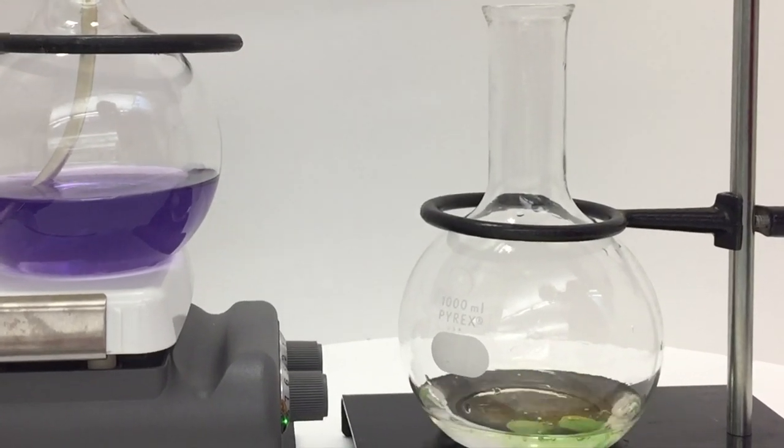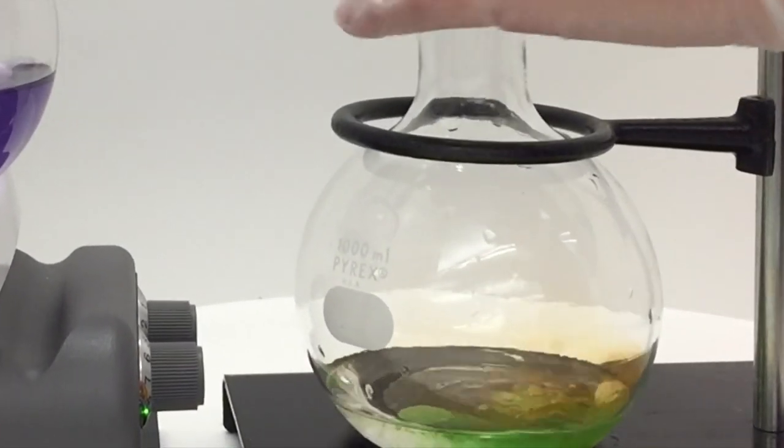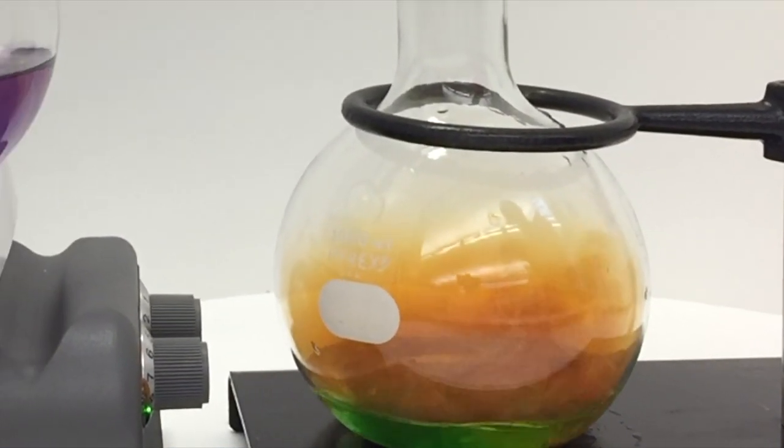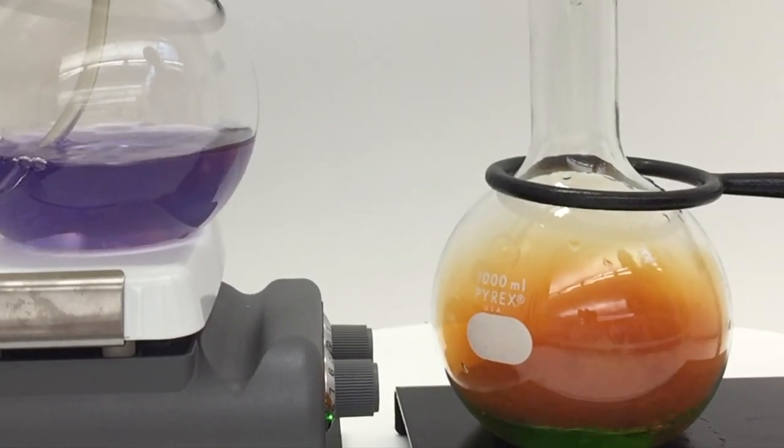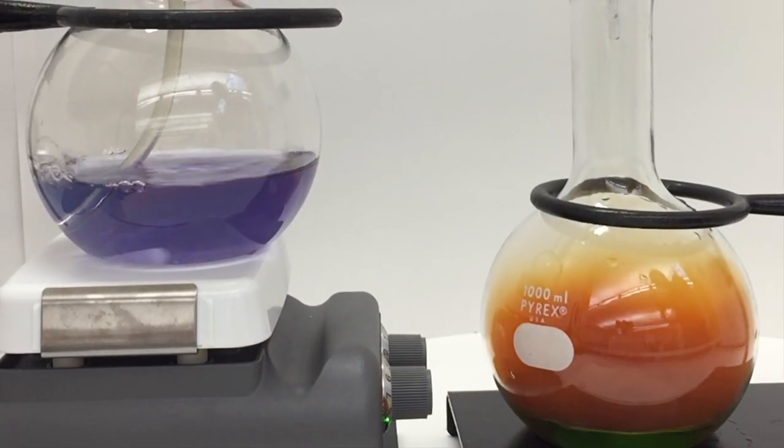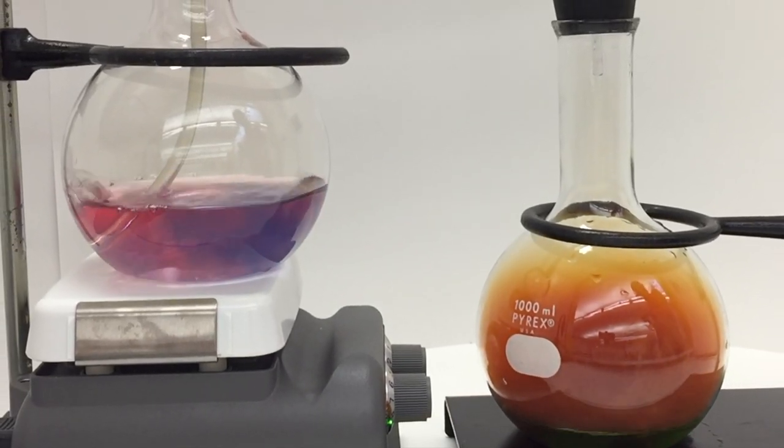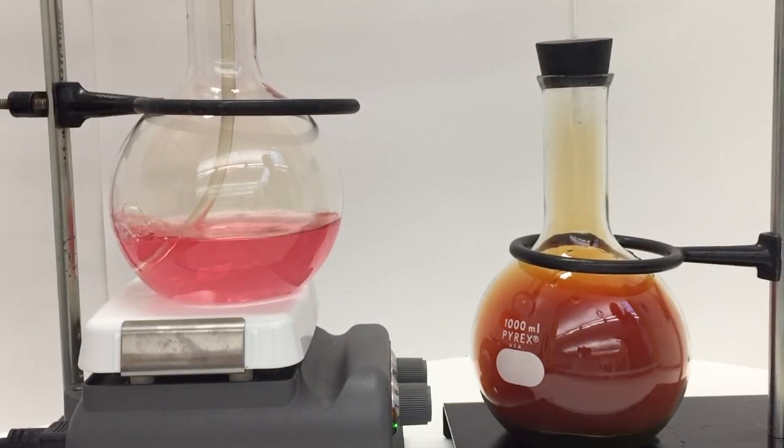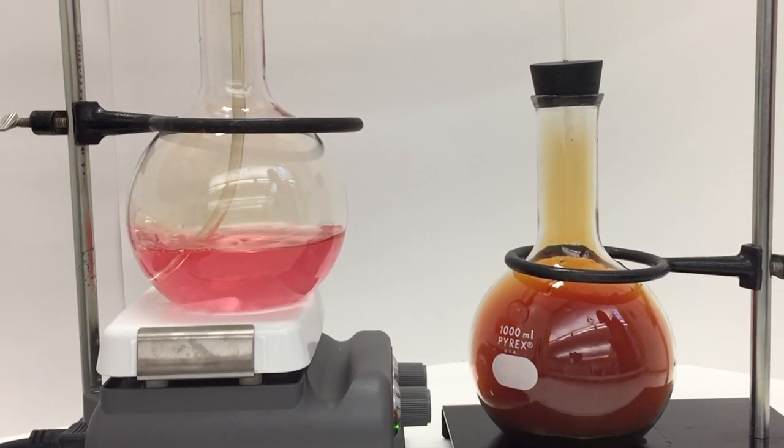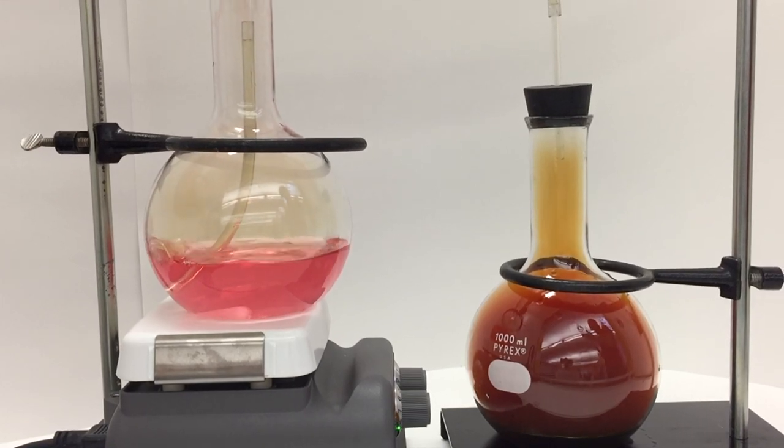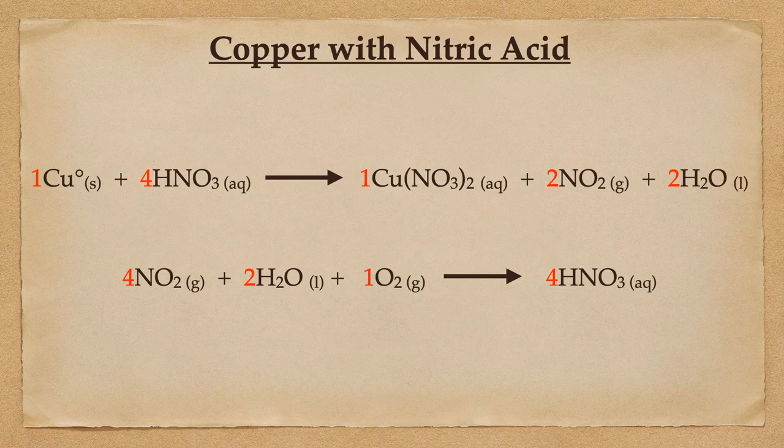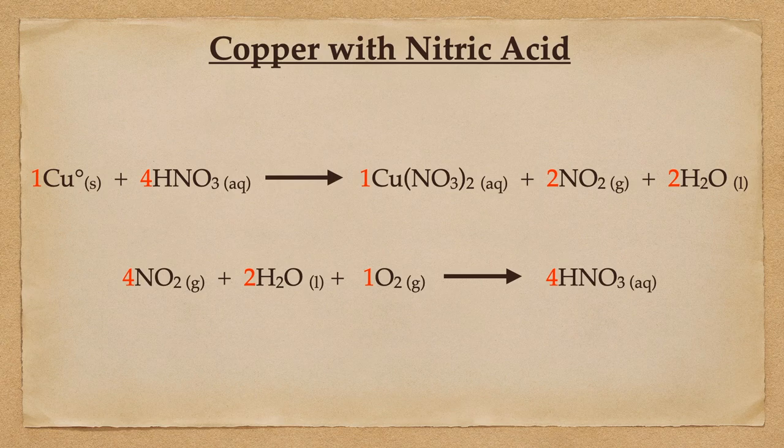You can see the reaction starts right away - you can see the green reaction there. The brown nitrogen dioxide gas is formed very rapidly. As that gas builds up in the flask and is pushed through the tube, my basic solution went very acidic. The bubbling of the nitrogen dioxide gas actually forms nitric acid, reforms nitric acid in my second flask. It went from basic to acidic in a matter of seconds.